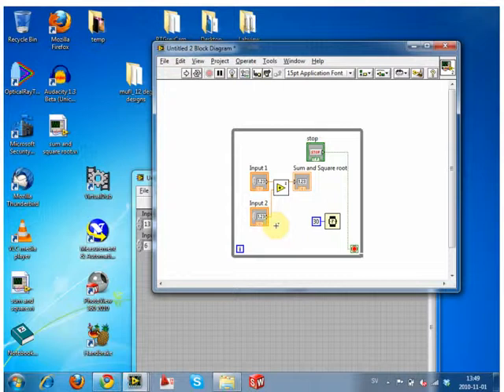So then we have the ability to change it on the fly, and we've been running it in real time. We have input and output nodes, and this is essentially the essence of what a sub-VI does. They're small programs, like the one from the example.